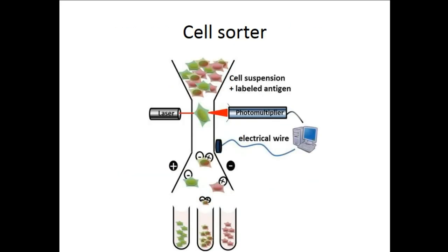So how does it do that? This is basically what happens. The flow cytometer identifies the fluorescently labeled stem cell, and the second that it identifies a stem cell, it applies a charge to that cell. In applying a charge to that cell, when it goes on through the flow cytometer, the charge enables it to be separated based on charge.